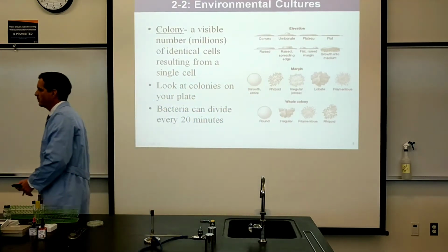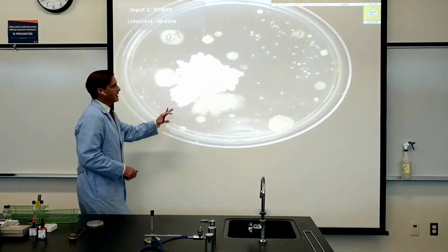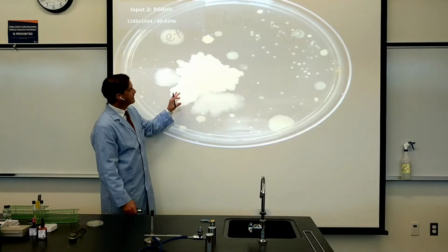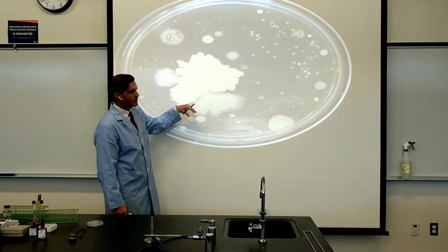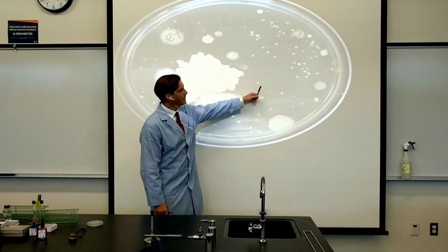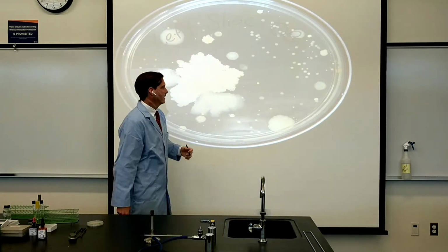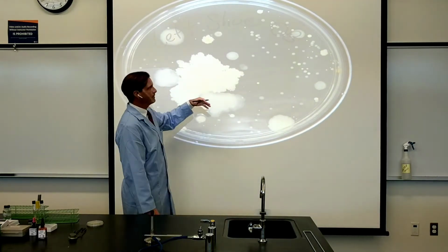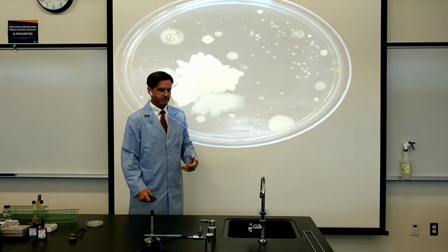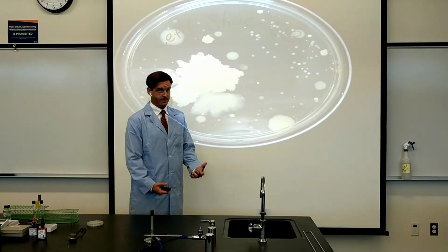And so I want to go back to that plate and analyze the colonies a little bit. So guys, back on our document camera, we can see that all different shapes and sizes of colony growths occur. Some have color. There can be orange, yellow, off-white. Sometimes you'll even find red or pink, and there are even purple bacteria, but they're just not that common.